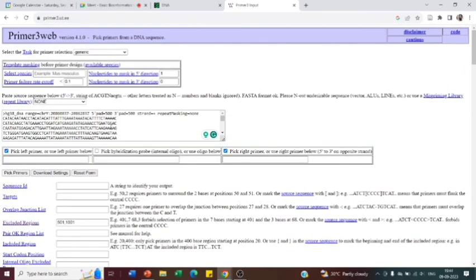This overhang is 500 base pair only. If they design the forward and reverse primer here, the size of the product will be less than 500. If it is designed in this overhang, it will also be less than 500. So our gene will not be there.